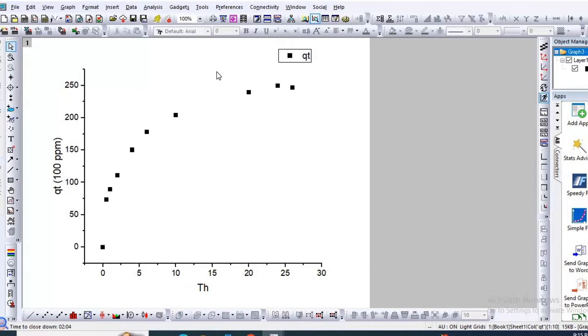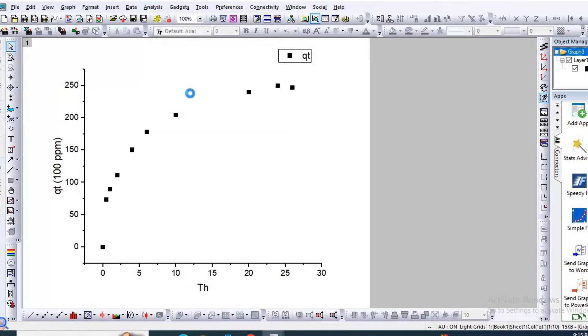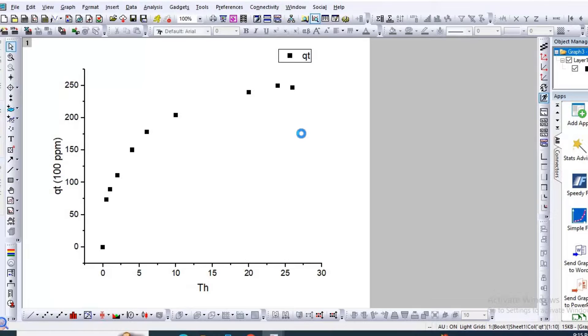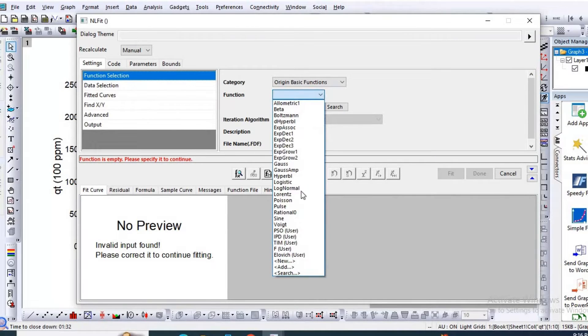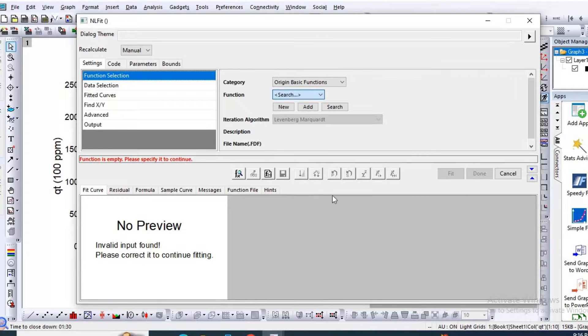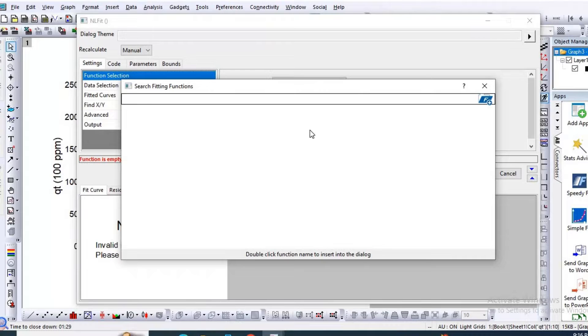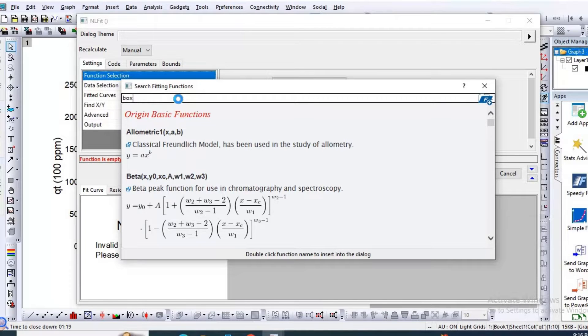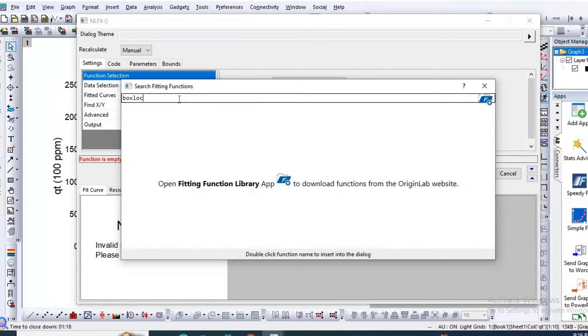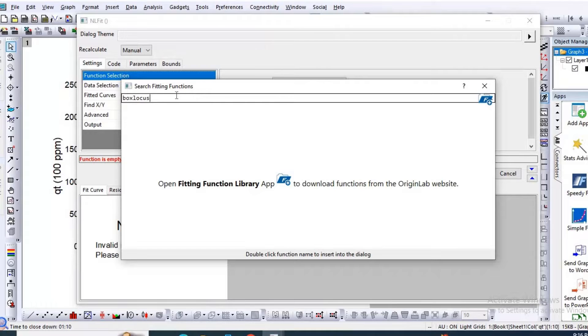In order to plot pseudo first order model, let us go to Analysis, then go to Nonlinear Curve Fit default. Then click here, then search. So nonlinear curve, the pseudo first order equation is equivalent to Box-Lucas equation. Search Box-Lucas.